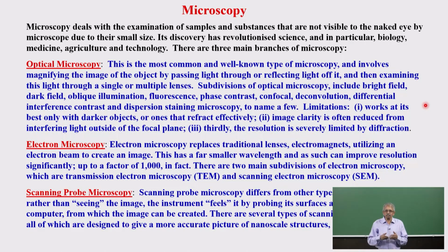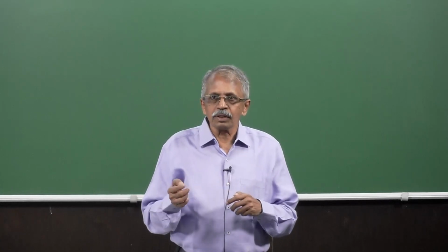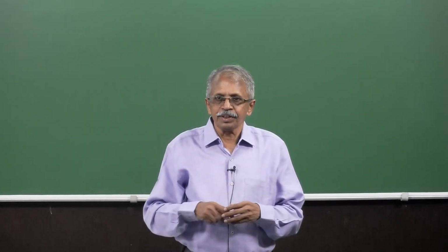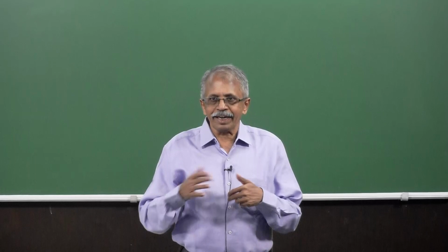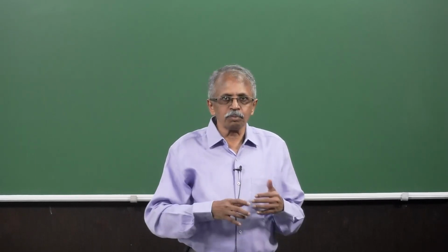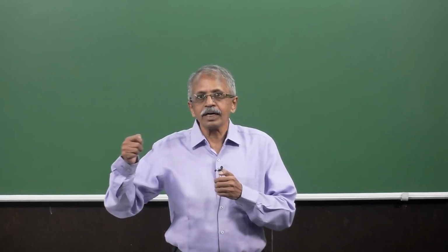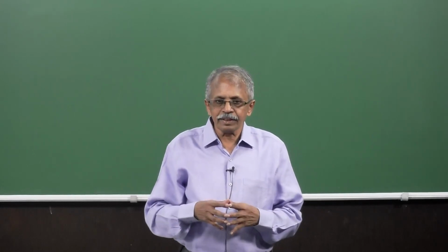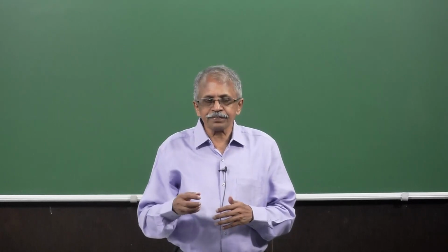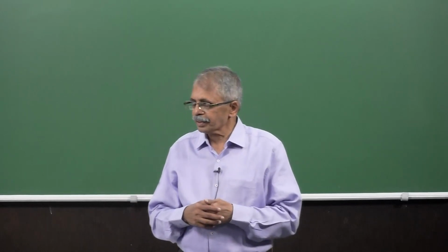Of course, we will not discuss much of light microscopy in this particular course because we are concerned with systems of molecules. The molecules are atomic size, nanometric size. So atoms and nanometric, and if you look at the layers, they could be in the micron size. So your studies are going to focus more on atoms, angstroms, nanometers and microns, but not millimeters or higher. So we are going to look at techniques which will give a magnification much beyond the light magnification that you are looking at.